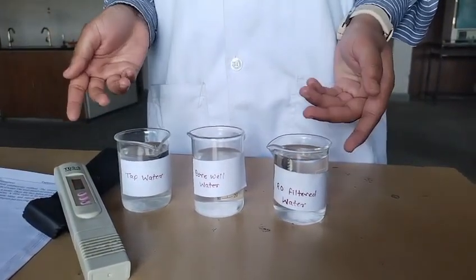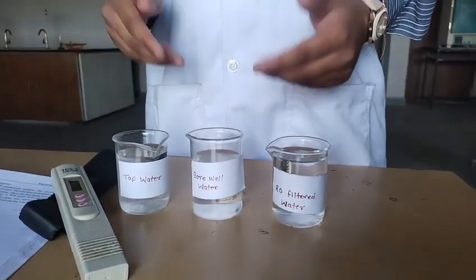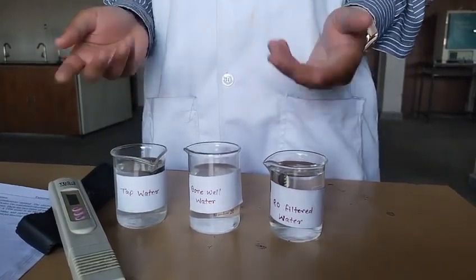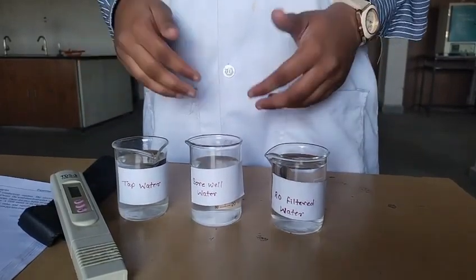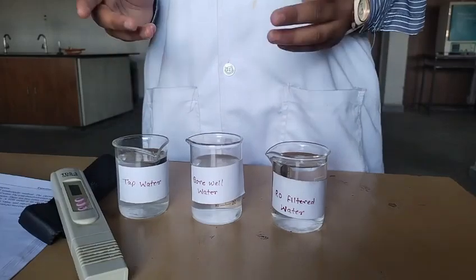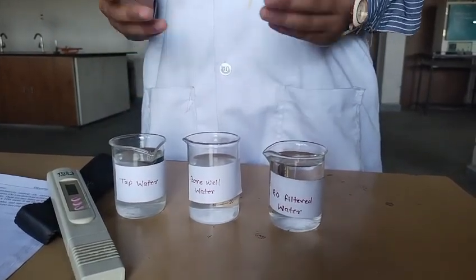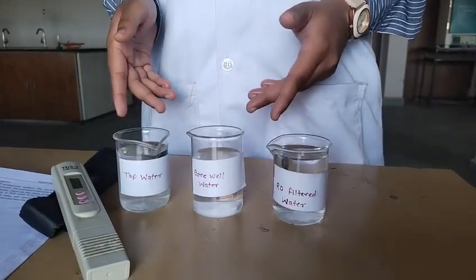The total amount of solid dissolved in water is one of the indicators of water quality in lakes, rivers and streams. Dissolved solids in water beyond a certain level can indicate poor quality of water. The same can be said of drinking water. Any minerals, salts, metals, cations or anions dissolved in water are referred to as dissolved solids.